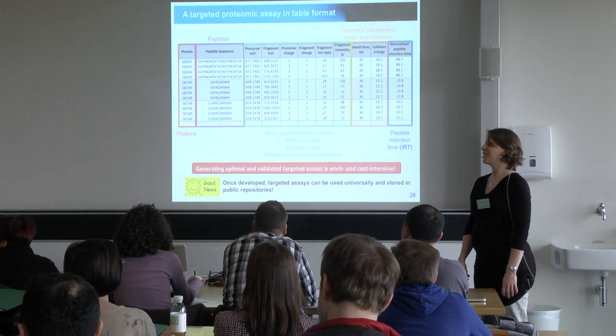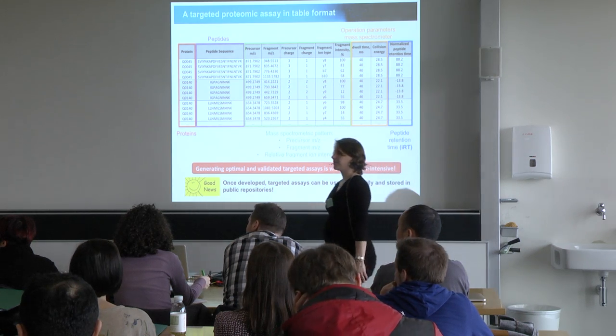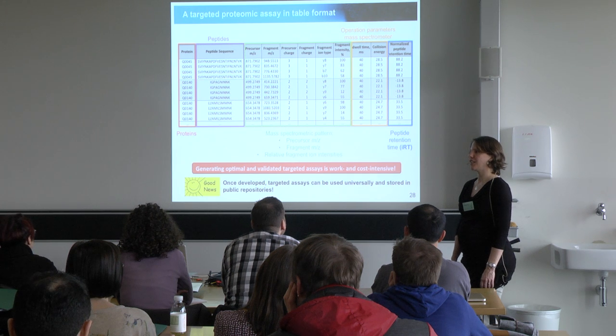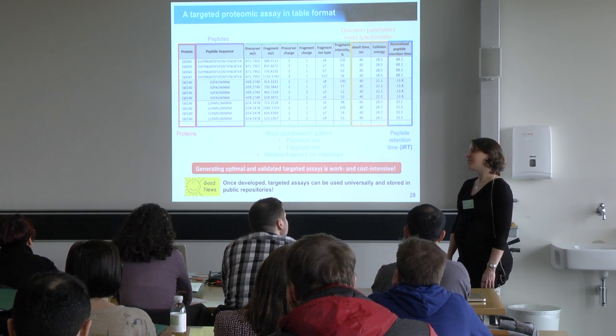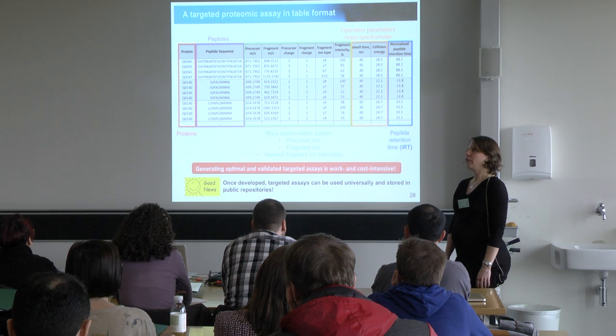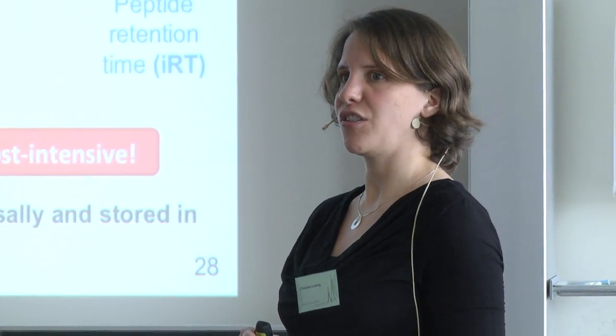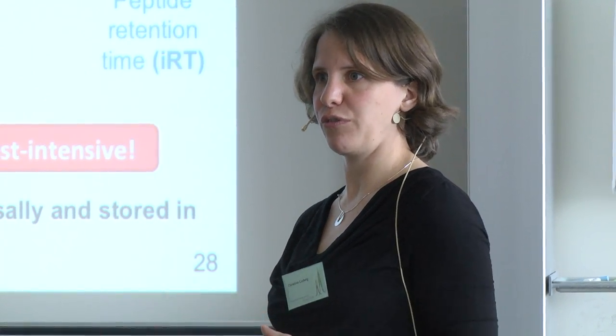Were there more questions? Yeah. So are there any instances of a single transition being used for a peptide where only one was good? I mean, has that ever made it to the publishing stage or not? Definitely. There are definitely papers out there that just quantify peptides with a single transition. However, it's not desirable to start like this. What often happens to me is that I start with 4 transitions or 5, and then maybe just one transition ends up being not interfered and useful for quantification.